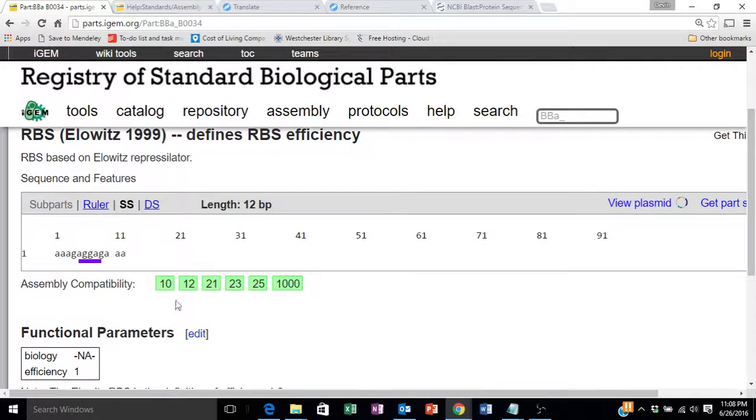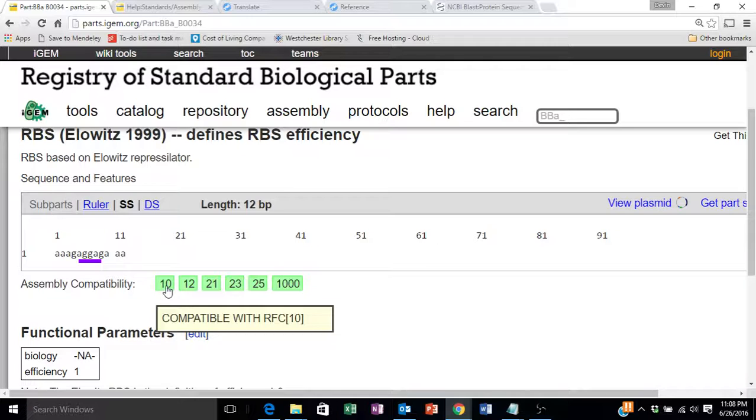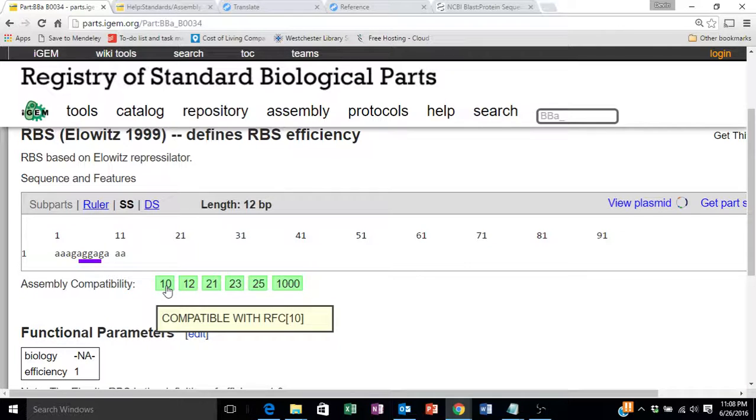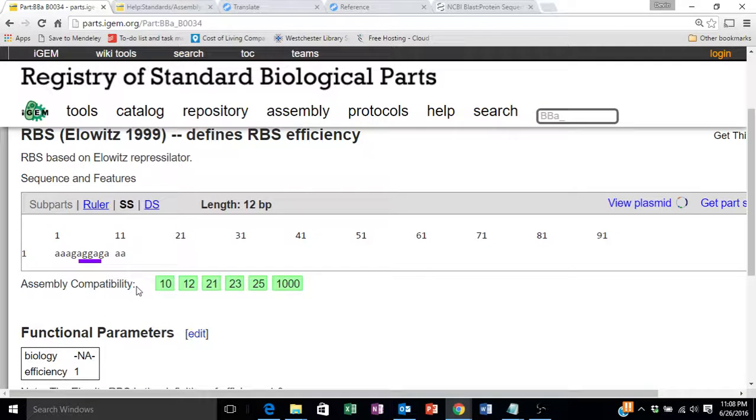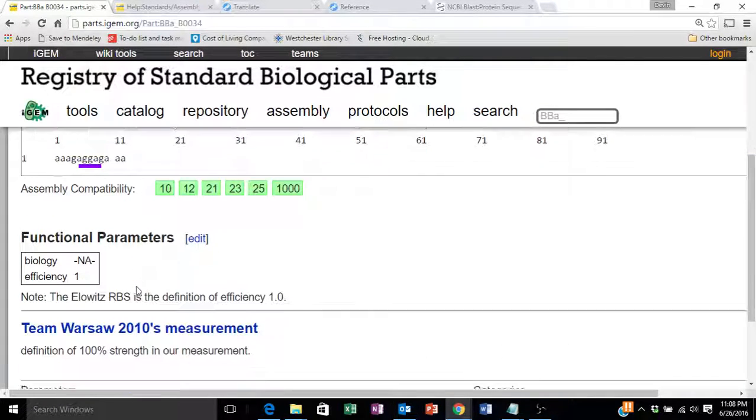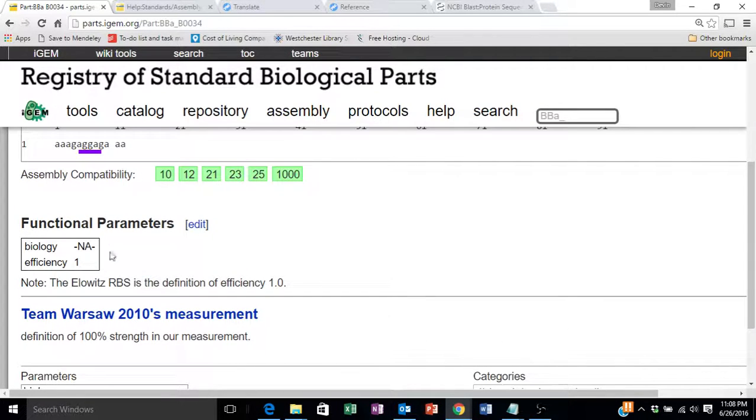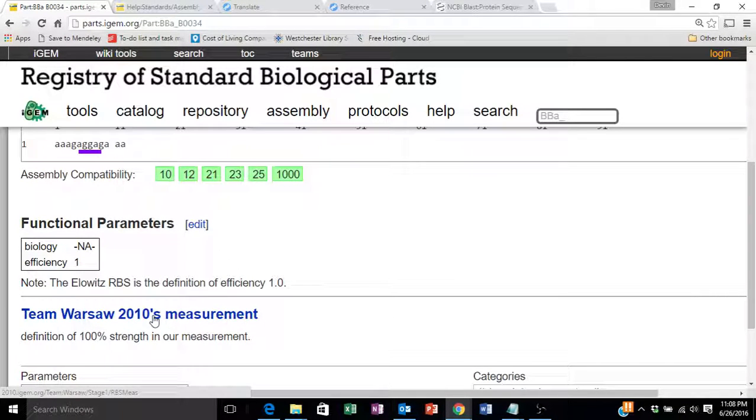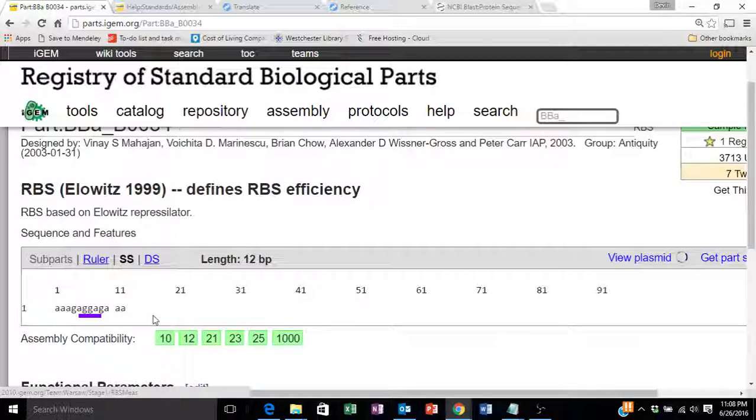This page also tells us which iGEM assembly standards this part is compatible with. There may be some other information. For example, the experience or use of this part by other teams.